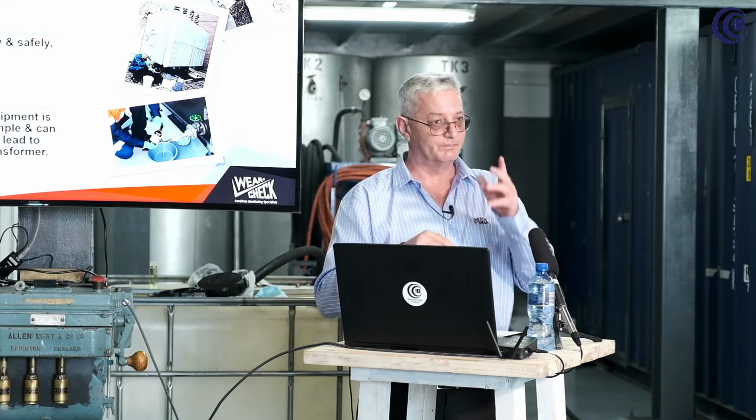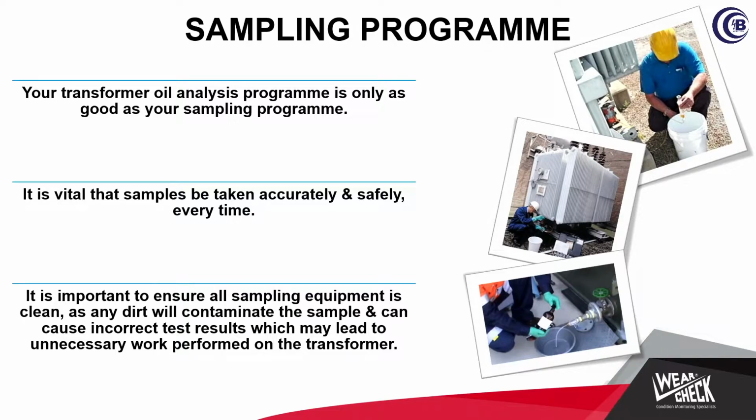Sampling, I'm just going to browse through sampling, where Baymont Cape is doing the sampling, but I just want to make a few comments around sampling. Now, if we get a tender, this morning I had to answer a question concerning a tender. The first question those tenders always ask you is, what's the certification of the labs? Do you have SANAS, SABS, 9000, 14000? What's your accreditation? Then they go from the people receiving the sample, to the people testing the sample, to me diagnosing that sample. What are the qualifications of those people? Are they qualified, or did I get someone from the street in to do the testing of the transformer oils?